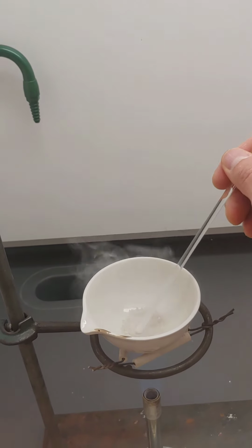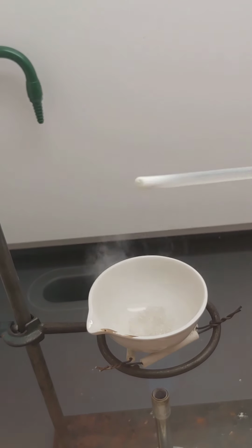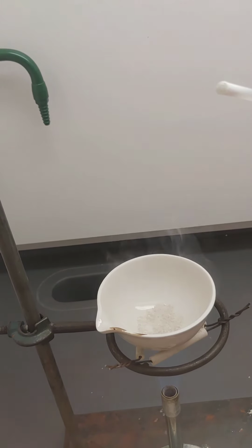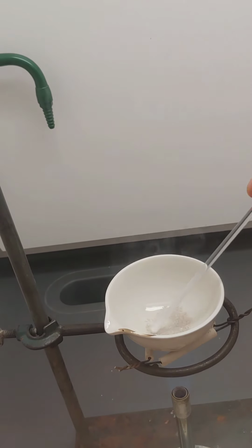You'll also notice that on the tip of my stir rod, if I show you the tip, you can see that it's starting to get white, and so it's getting coated with solid ammonium chloride. As that ammonium chloride is subliming off, it's condensing and then reforming as a solid on the tip of the stir rod.